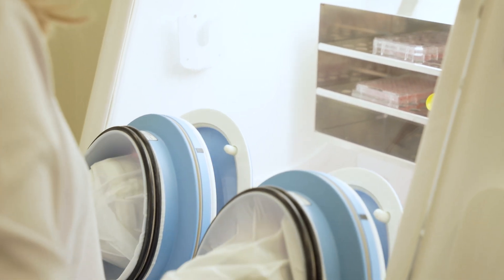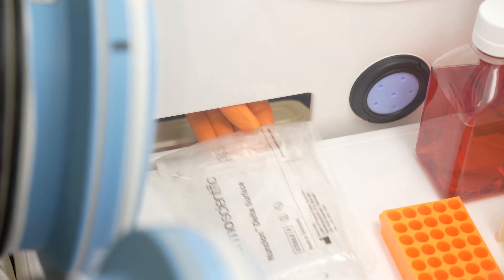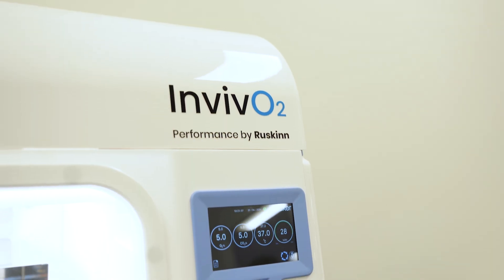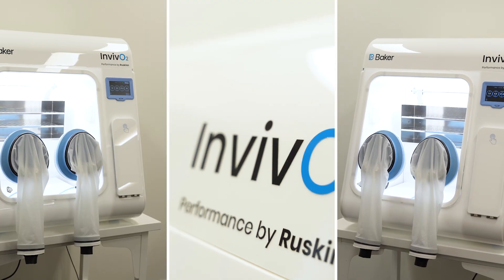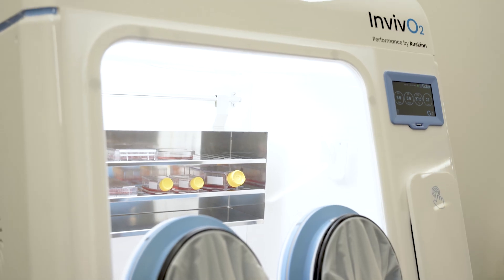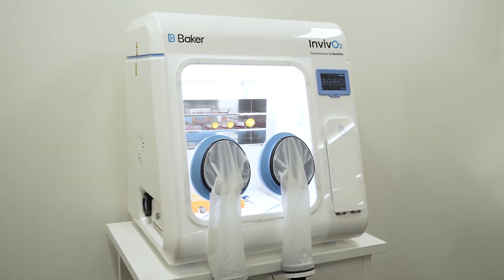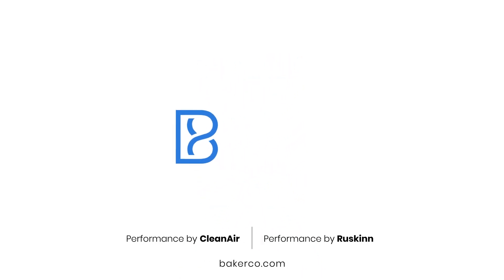Built with researchers in mind, the i300 is loaded with features to support your work — from the single plate entry system to optional internal and external HEPA filtration and a long-life precision oxygen sensor. The integrated design delivers high performance without breaking your budget. Achieve the optimal environment for science with the In Vivo 300 from Baker.